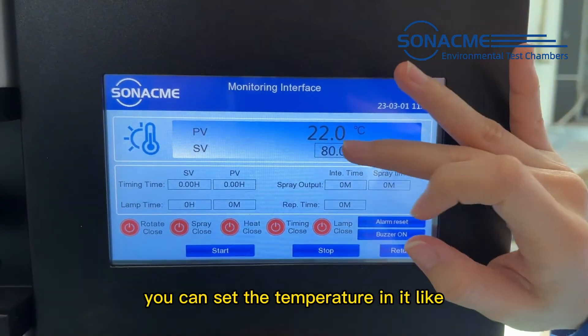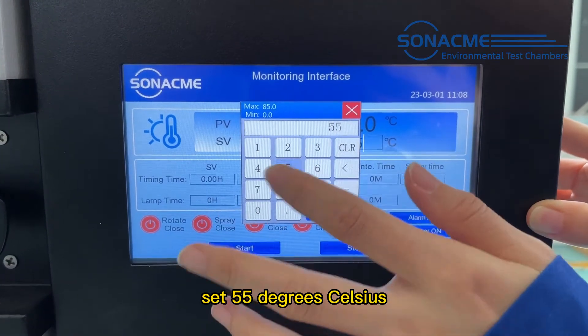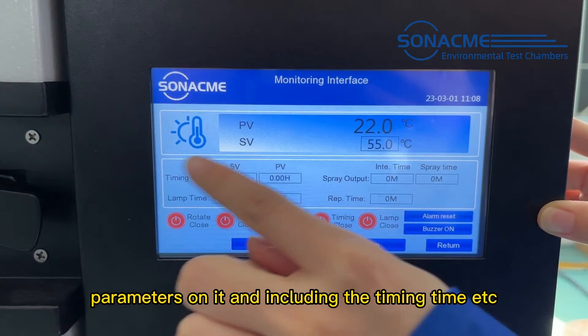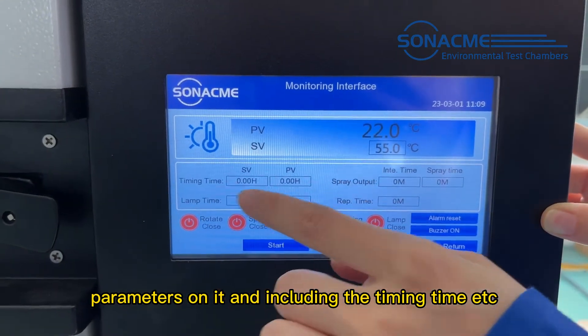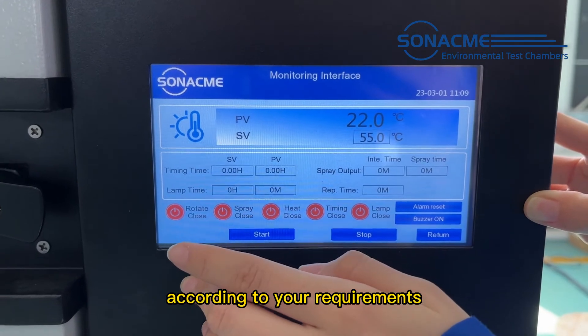You can set the temperature — for example, set 55 degrees Celsius. Then you can set the parameters, including the timing time, and open the random functions according to your requirements.